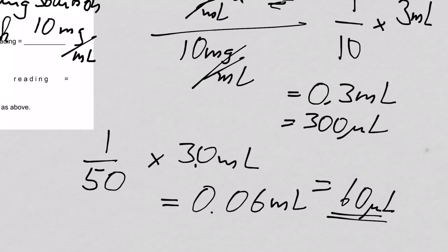And again, you measure the concentration. In your spectrophotometer, first you blank, and then you just simply put the cuvettes with the different concentrations in the spec and take the reading. Okay? Happy with that? Okay, now here the big question.